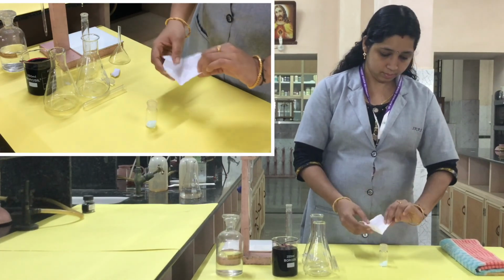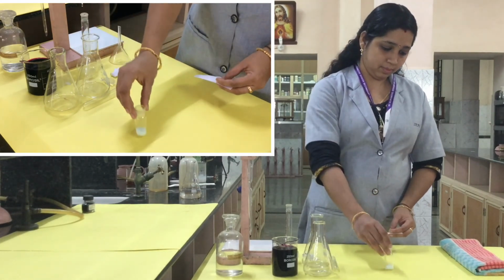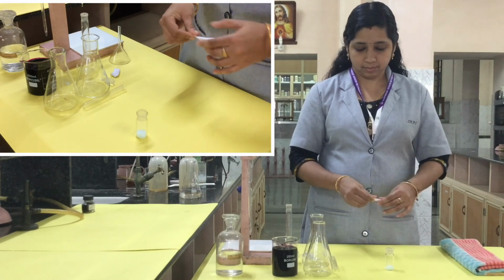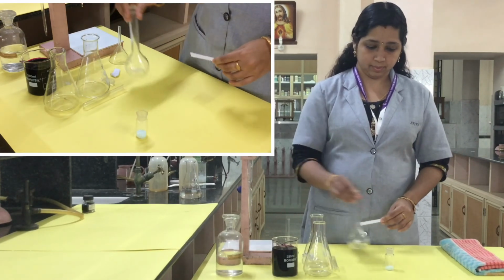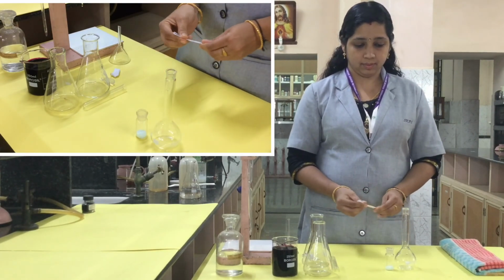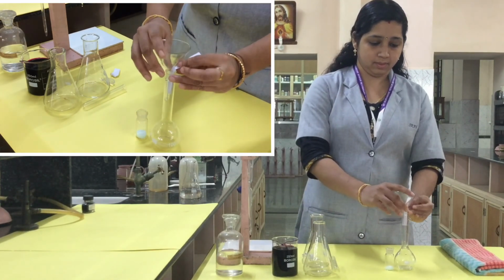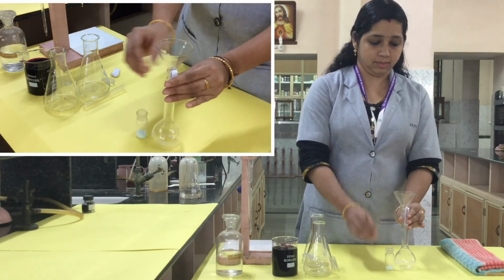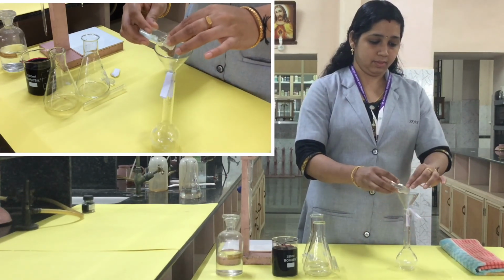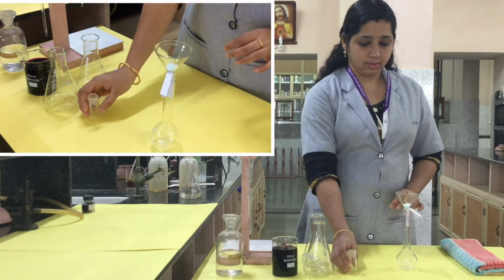Then you have to take the weight of this Mohr salt plus bottle. Then after taking the weight, the contents in the weighing bottle, that is the Mohr salt, you have to transfer into the standard flask using the funnel. Transfer that Mohr salt into the standard flask.